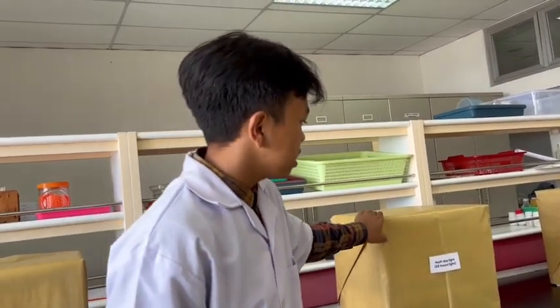Okay, and every germination seed that I plant here will be measured for the environmental parameters and qualitative parameters and quantitative parameters at 7 p.m. And I also turn off the lamp for the 12 hours light at 7 a.m. and I turn it off again at 7 p.m.